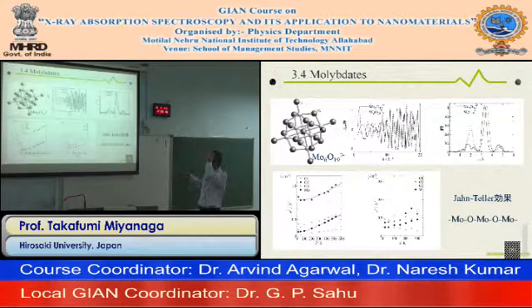For tungsten, all atoms are very similar and increase with temperature. But in the case of molybdenum, only the O2. O2 means the nearest neighbor bridging oxygen has a very large distortion. Very large distortions, but the temperature dependence is similar. This means that we expected the Jahn-Teller effect, with long and short bond distortions.